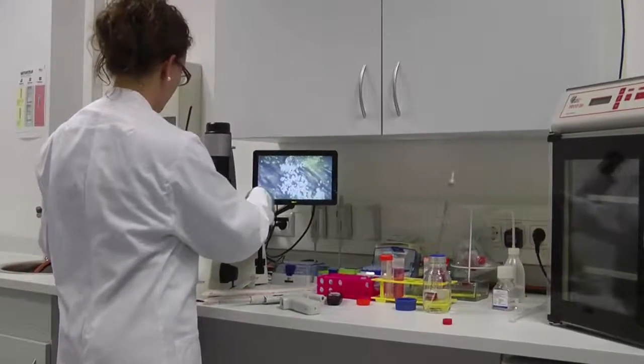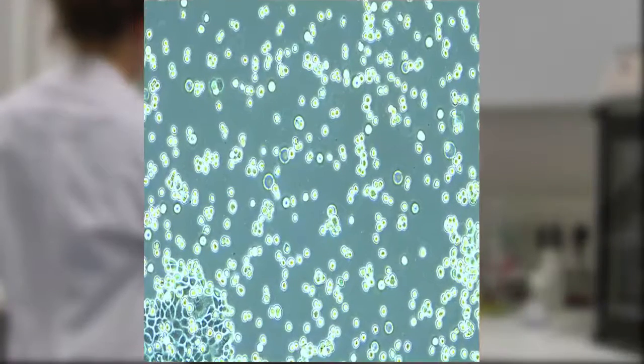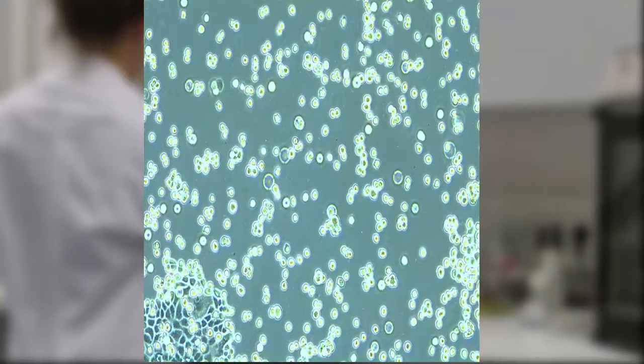Detached cells should be round-shaped and free-floating in the trypsin solution. As soon as cells have detached, add 5 ml culture medium to the dish to inactivate the trypsin.